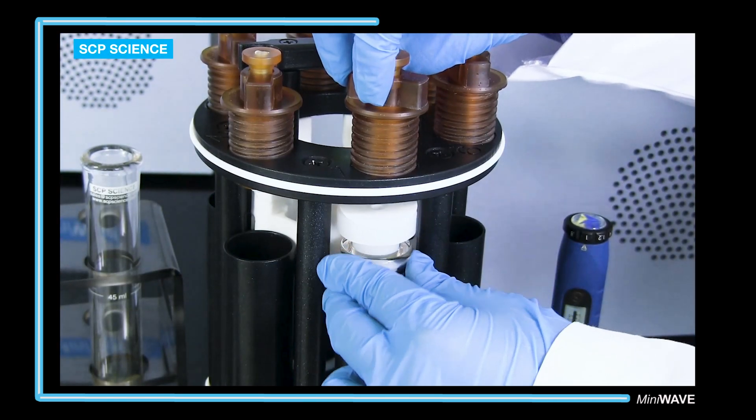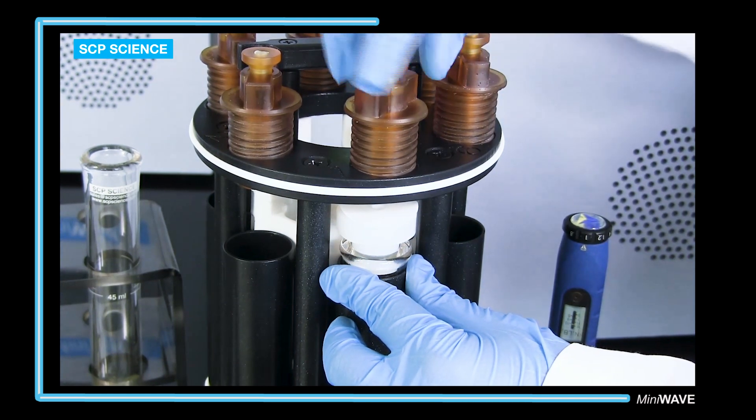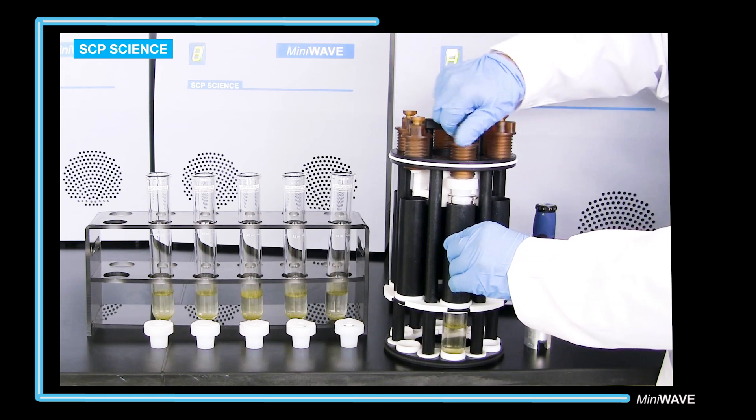The vessel is placed in the tube extender with the PFA cap, then the safety pressure cap is tightened — first by hand, then using the torque wrench.